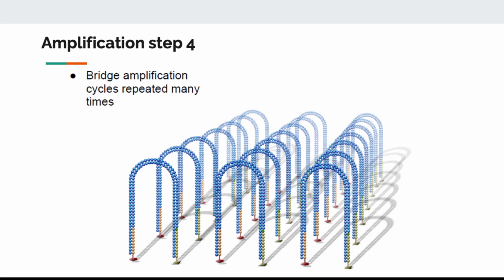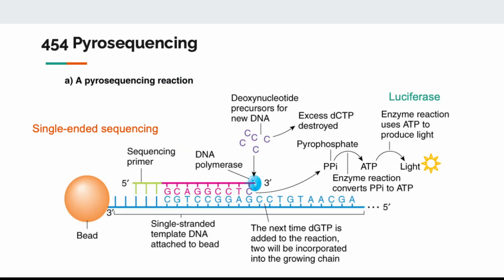So next, once we amplify the DNA, we want to know the actual DNA sequence. Right? We need to do the polymerization reaction and read out which nucleotide gets incorporated. There are several ways of doing this. In the early days, people realized that when a nucleotide is incorporated into the polymerization reaction, one of the products is the phosphate, the pyrophosphate group.